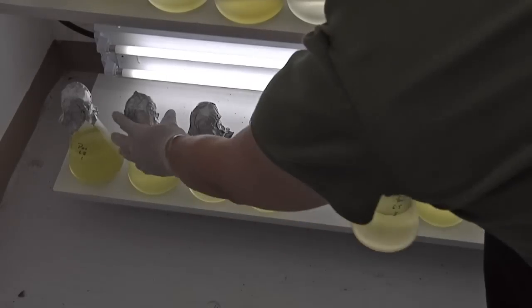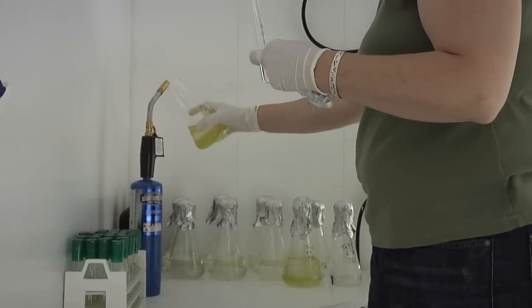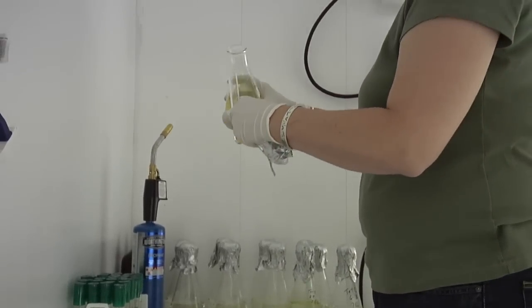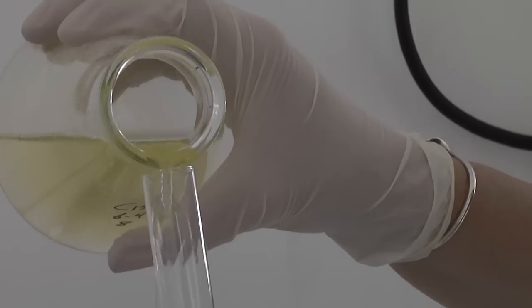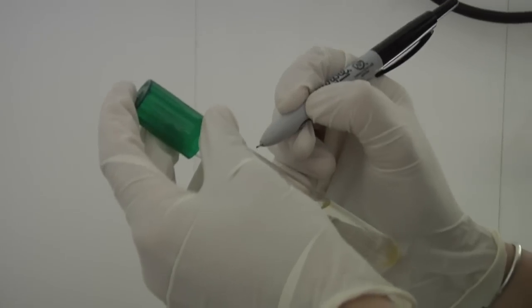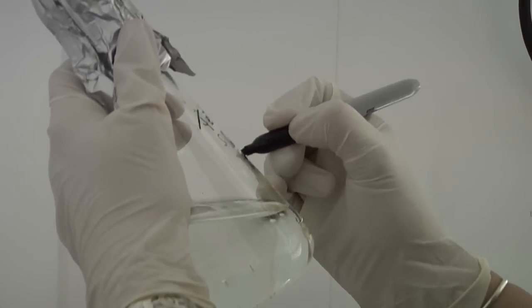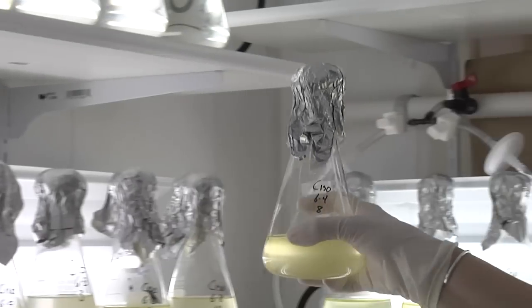At the same time, whenever we do a transfer, we take a few drops and put them into a growth medium that will test to see if there's any bacteria in the sample. All of the samples are labeled with the same labeling system as the flasks so we can track how each sample is doing.